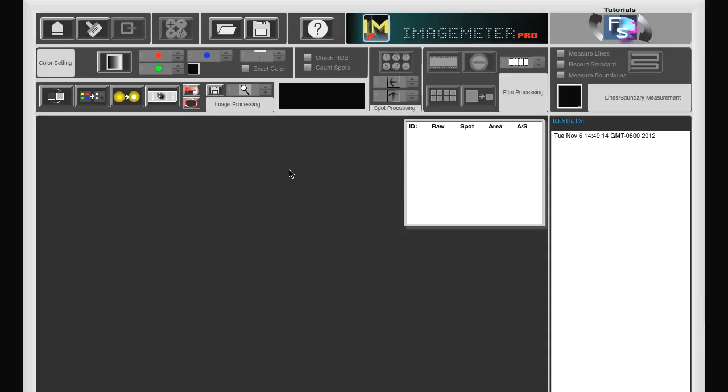ImageMeter Pro. In this lesson I show you how to use ImageMeter Pro for blots, like for instance Western blots. We first import the image.